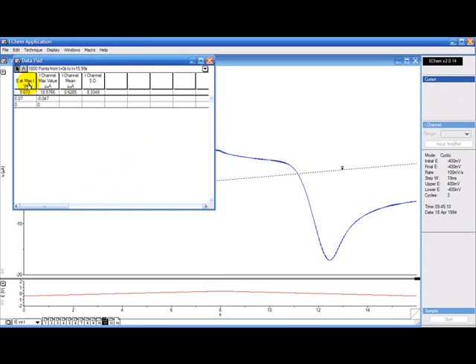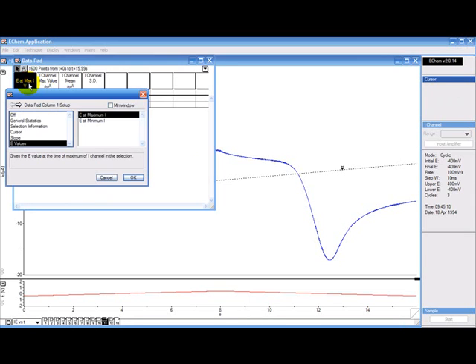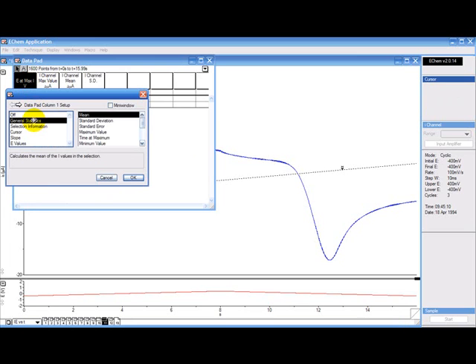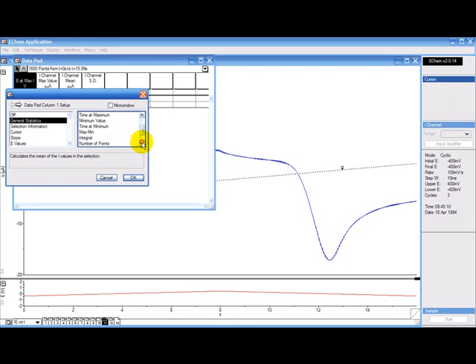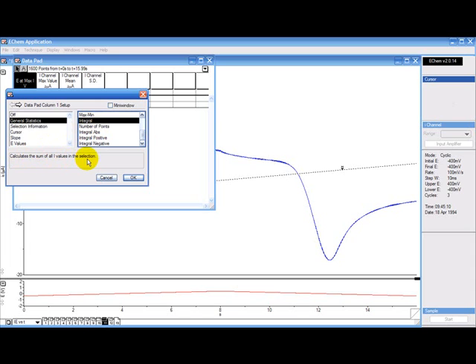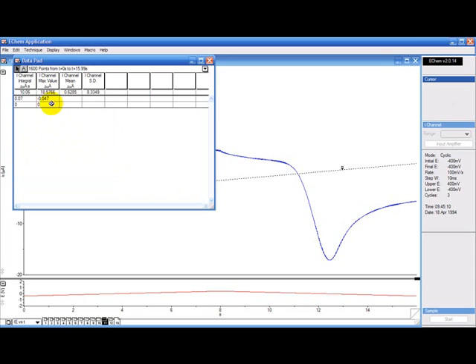You click on one of the columns and you need to find the integral. It's in general statistics. Here we have the integral. It says it calculates the sum of all i values in the selection. Click OK and you can now drag this value and close the data pad.